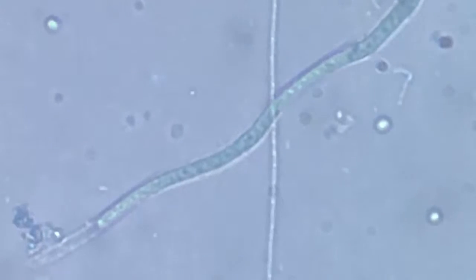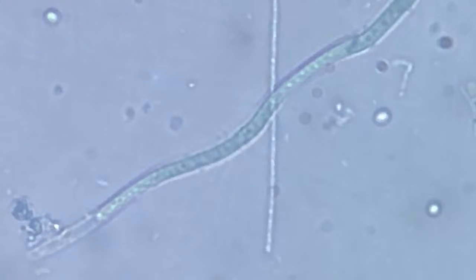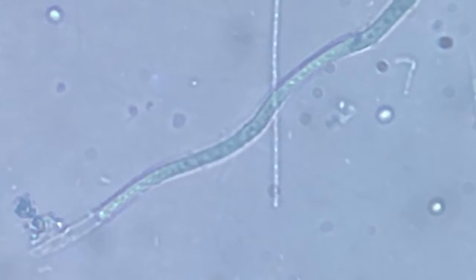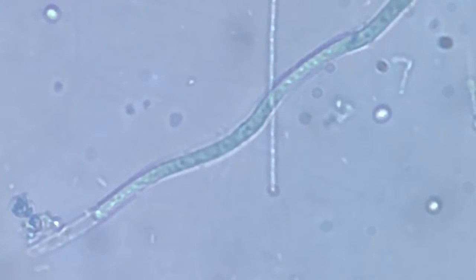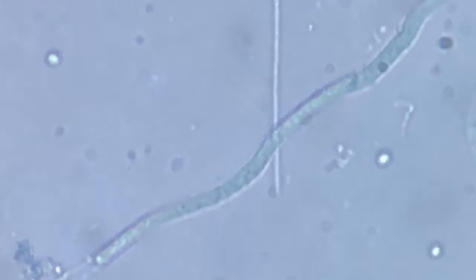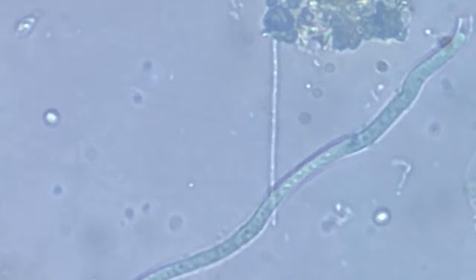And adjacent we have a filament of that algae, so as to give a comparison and an understanding that it is different from this algae. It's not that algae, it's something else. So it's moving straight like a train, and I don't know what it is. Probably it's slow because it's pressed under this filament. Maybe after it's crossing this filament, it will be a little fast. That's a presumption, but that hardly makes any difference.